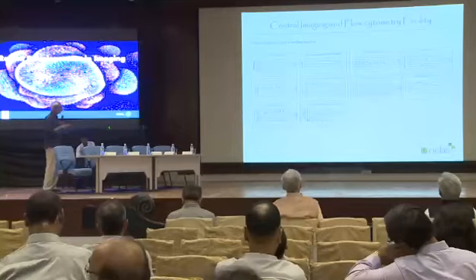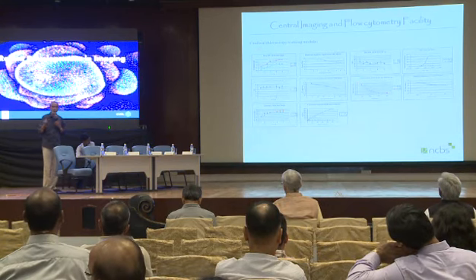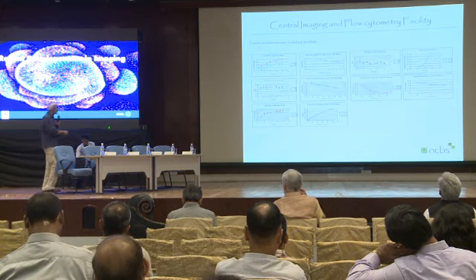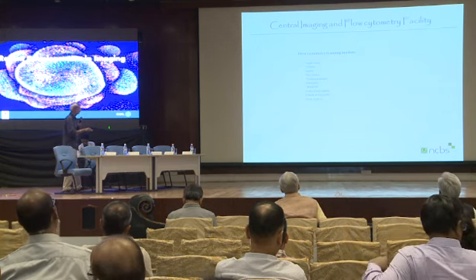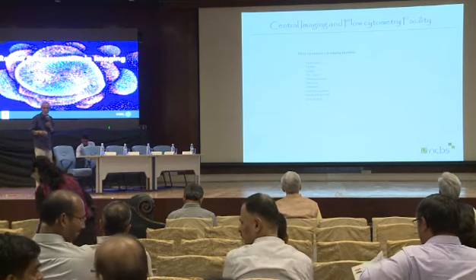And while they are learning, we also tell them what kind of care they have to take while using these systems, and that makes it much more important. In fact, I can say that operators break the machines more than the students, because students also know that if they break the machines, they don't have a machine next day for doing an experiment. Next slide, please. So this is, again, a training module which we have developed for flow cytometry. These are the things which we cover in flow cytometry training program.